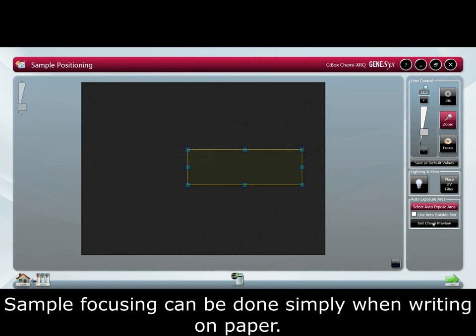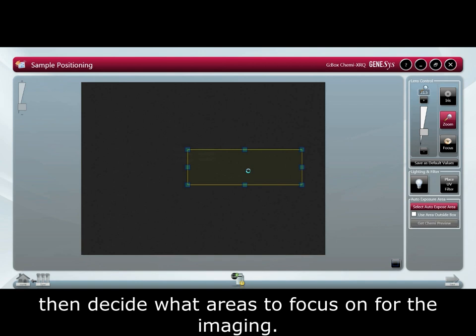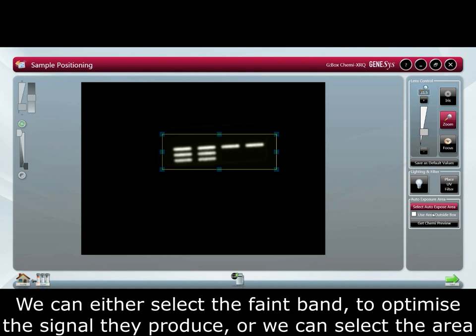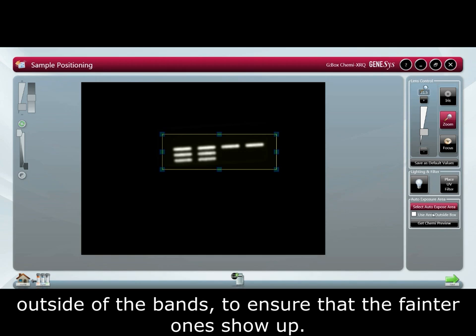Chemi preview is a feature which enables the user to quickly see the positioning of bands and then decide which areas to focus on for imaging. This allows us to use auto expose area, which is a powerful feature if you have both bright and faint bands on the same blot. We can either select the faint bands to optimize the signal they produce, or select the area outside of the bands to ensure the faint ones show up.